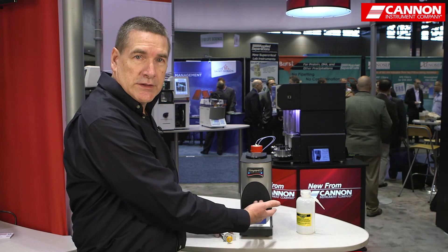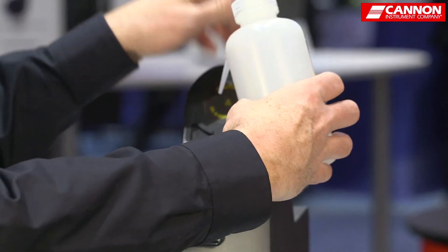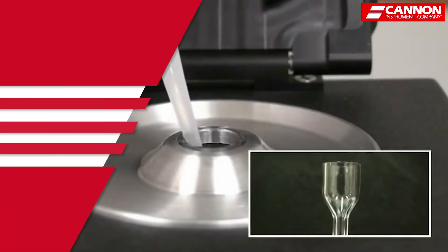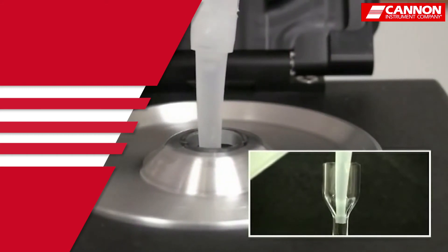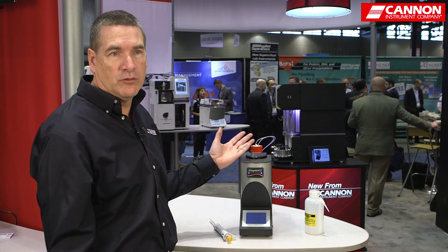Then I will need to clean the viscometer, and the easy instructions on the screen will tell me when it's time. I simply have a squirt bottle, put it in the top, and it will tell me when to remove it, when to insert it, and the vacuum pulls the solvent through. It will tell me when it's finished, and I can close the lid and wait for the next sample.